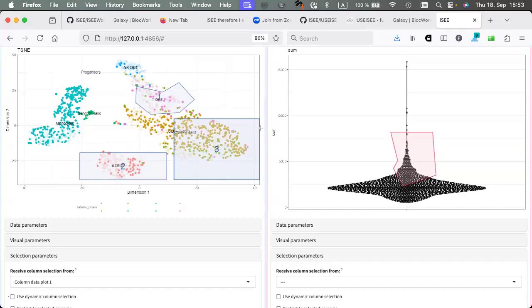We didn't do that, but Jeff Moffitt's lab did. They took a column data plot, put an X and a Y, and basically plotted something like an H&E stained image, so they have a spatial data plot. I'm not saying cheating, but let's say exploiting the open ends of the software. So yeah.